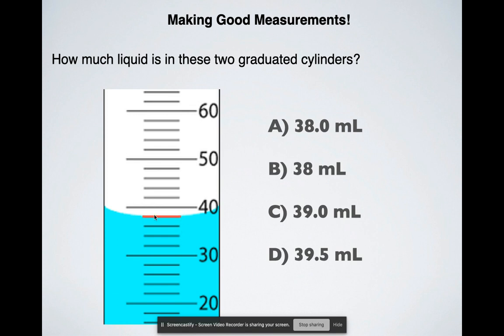Okay now when you're measuring liquid in a graduated cylinder you're looking at the lowest point so we're looking at the meniscus is technically what it's called here and so the meniscus will always, well assuming we're looking at water, it will always be concave like this and so you're always looking at this portion here the lowest part of the meniscus. Now you should also be at eye level with it so you should actually be looking straight directly through the graduated cylinder right where that line is and if you're having problems making a measurement you just put a piece of white paper behind there to help you out.